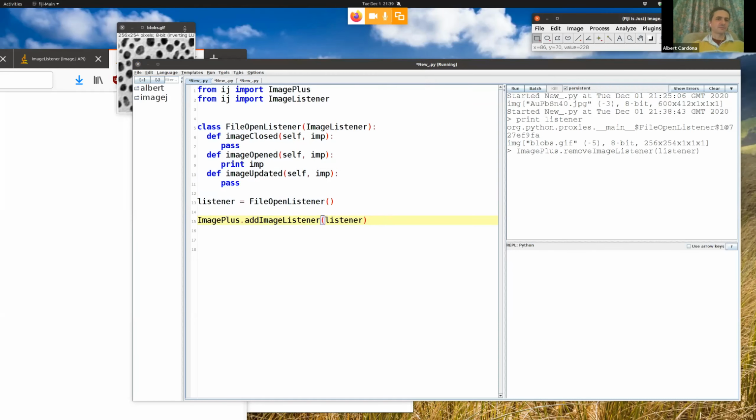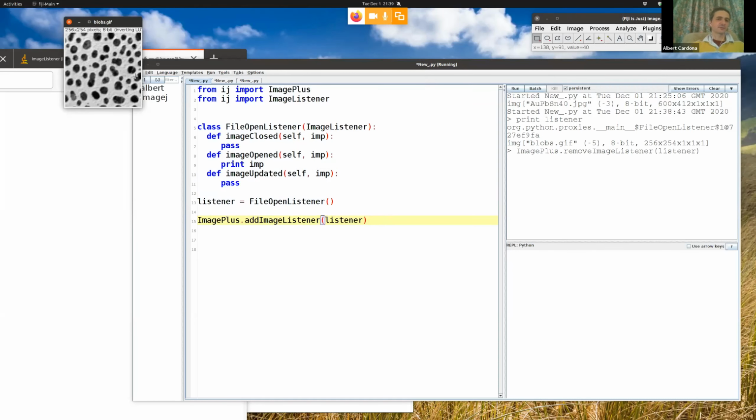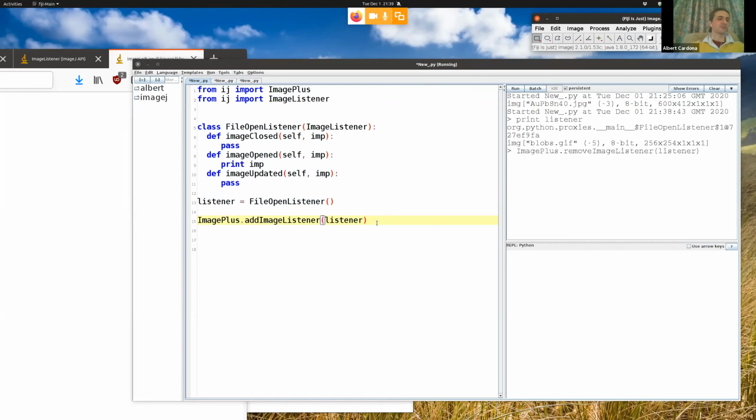So running the scripts under persistent is very convenient because it executes all the way until it runs into an error or the end of the script. And so then, if you loaded a very huge data set, it's still there. You can just fix the script and execute. And so another way in which we could have done what I just did is to type it here. And now what I'm going to do is comment it out to make it easier, okay?